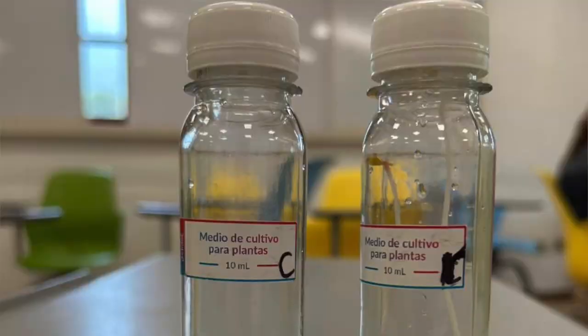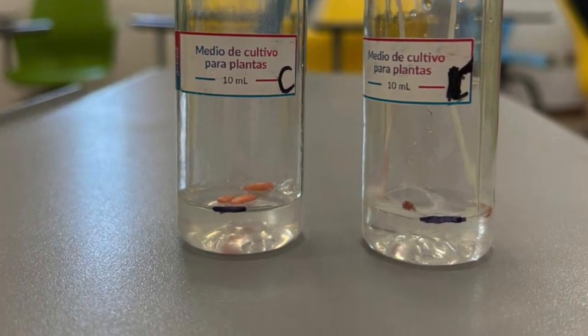So I'm going to analyze the results of this project. We can see that the radish seed grew 16 centimeters in 6 days, and it had no sunlight. You are able to see in the images how much the seed grew. This happened because of the Murashige and Skoog gel that was located with the seed. This gel gave the seed all the nutrients that it needed to grow and germinate. The reason why the radish grew and the cucumber did not is because the radish takes approximately 3 to 5 days to germinate, while the cucumber takes approximately 7 to 10 days to germinate.